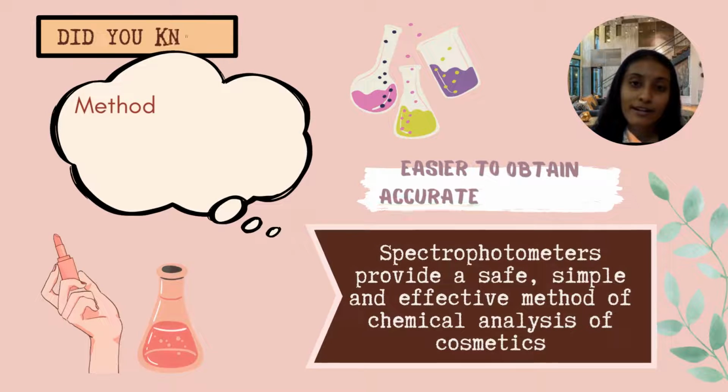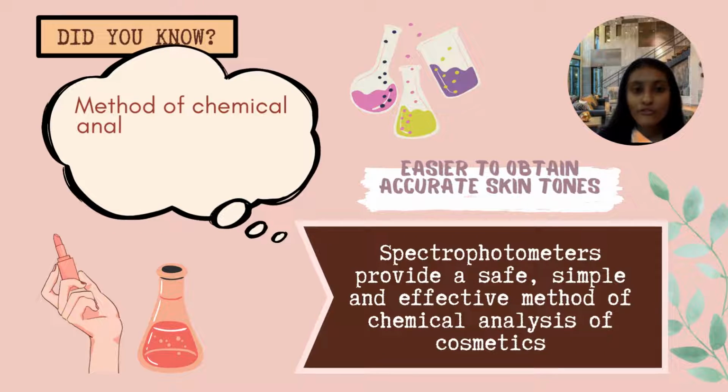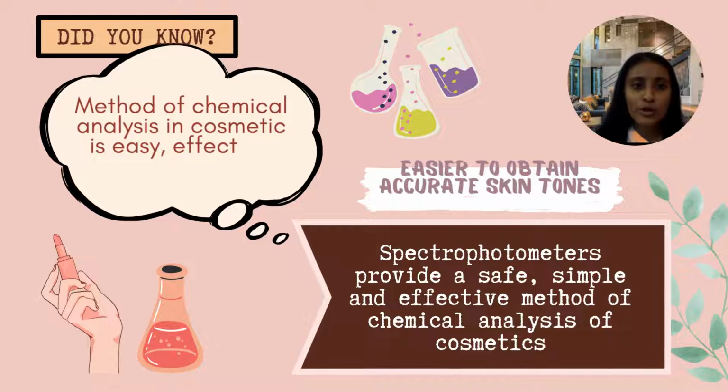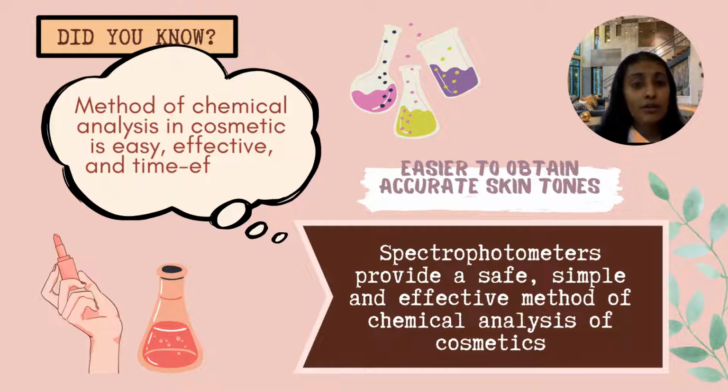Today's cosmetics market is an international superpower, offering an overwhelming variety of options. When faced with all those options, consumers use the quality and safety of a product to dictate their spending. Chemical analysis is often used to ensure both the purity and quality of cosmetics and other dermatological formulations. The good news is that new technology like spectrophotometers can help producers detect impurity and other harmful additives in makeup.